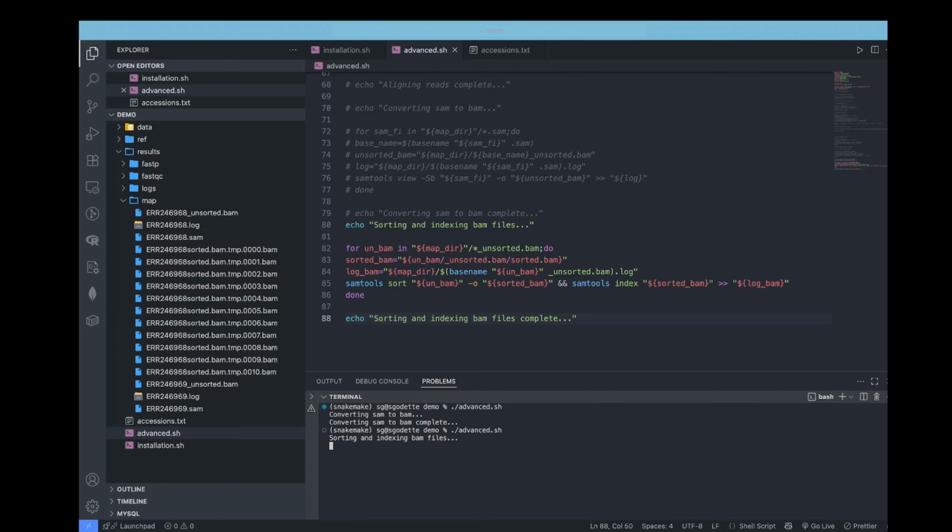So you can see that we did not catch one of the problems. It's directly connecting the sample name with the sorted.bam. So we can simply correct that. What we can do is just terminate this and correct that as soon as possible. Here we want an underscore sorted.bam. So everything can now run correctly.